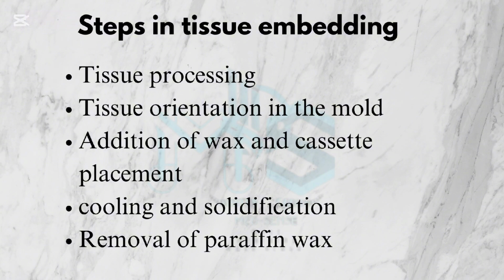The next one, steps in tissue embedding. Now, this may or may not also be necessary, but I thought to include it in this video so that you would have all the knowledge at your disposal. It's better to be over-prepared than to be under-prepared.